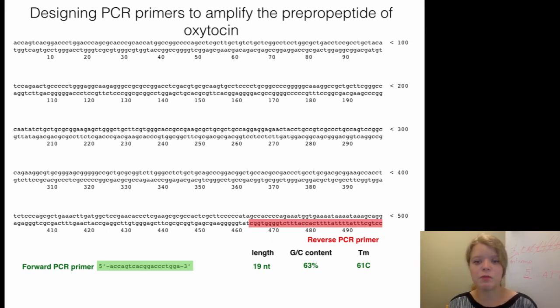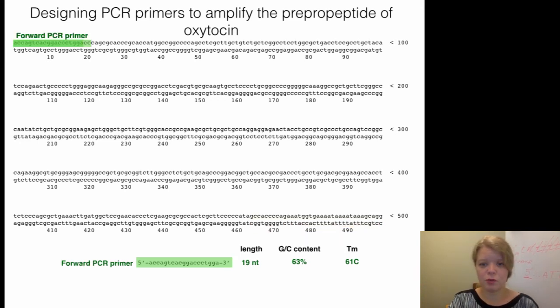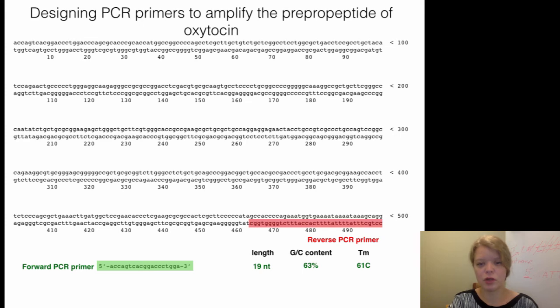So what about this? What about me increasing the length of the primer? So I've took a whole lot more, like about 12 more nucleotides. And what I was going for here is, you can see that the previous primer stops here, and just adding that extra T will not help me. And hopefully these G's, however, because they have 3 hydrogen bonds to bind to C's instead of 2 hydrogen bonds of A's and T's, will significantly increase the melting temperature, and also this will improve the GC content that we're trying to achieve, which is between 40 and 60.